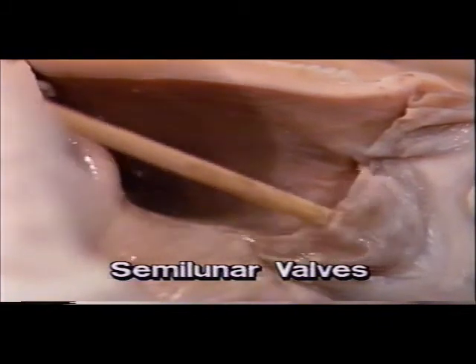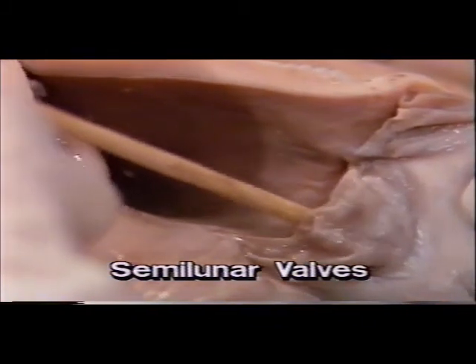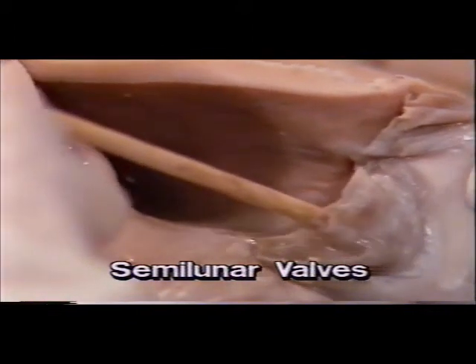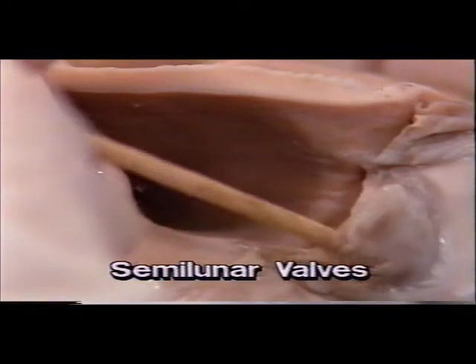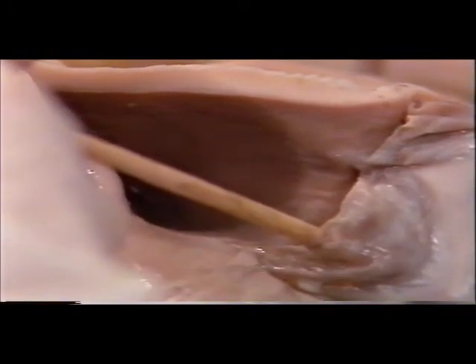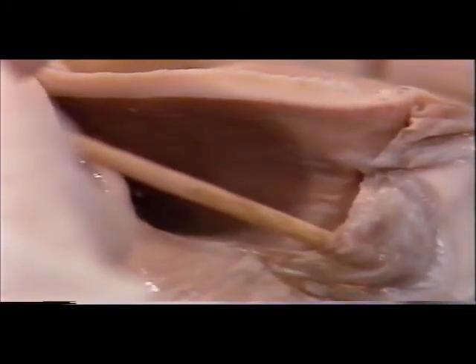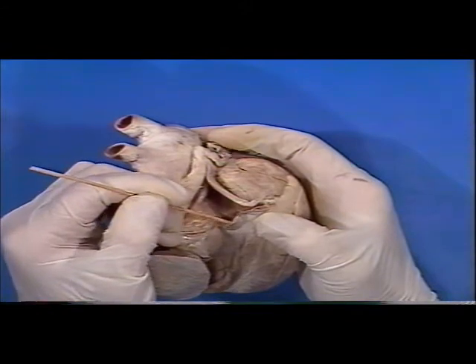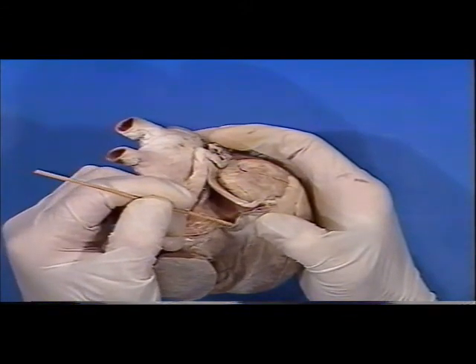These relatively small valves are named for their half-moon shape. Each of the valves has 3 of these half-moon cup-like portions. When blood has been pumped into the great vessels, these valves prevent it from returning to the ventricles. This saves a great amount of effort for the heart.